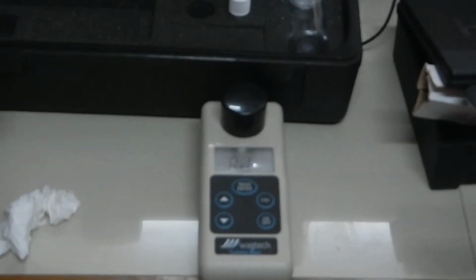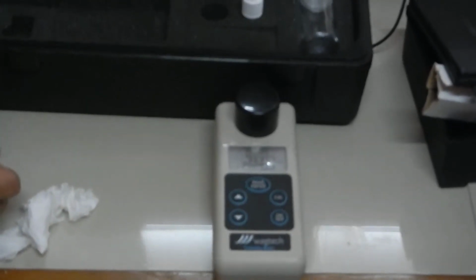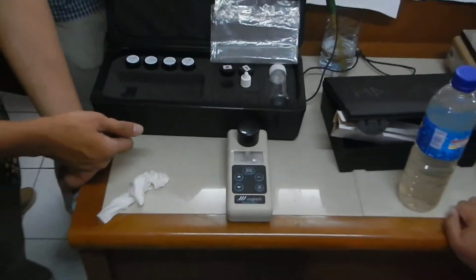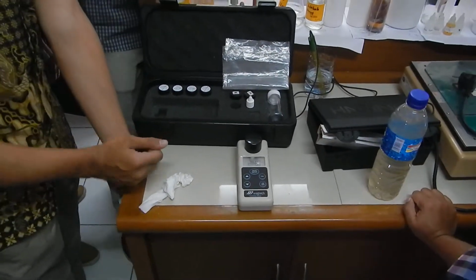And what kind of water do we use to calibrate it? You buy standard solutions from the manufacturer. So all these are standard solutions from the manufacturer. 24. And we're way off. No, it's lower than I thought it would be.